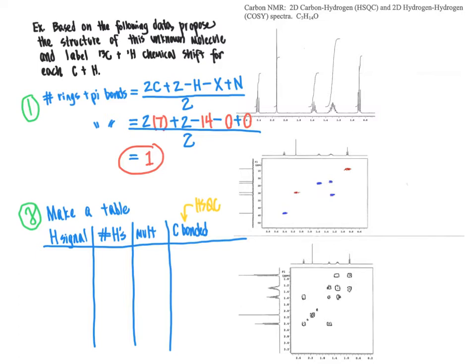And as we are looking at our proton NMR spectrum up at the upper right, if the print here is too small for you to see the axes, I highly recommend that you have the printout of this spectral data, or you have this displayed on some other device. You can download this full data set with this module. So you'll want to be able to see that for sure, regardless of how small your screen is that you're viewing this on.